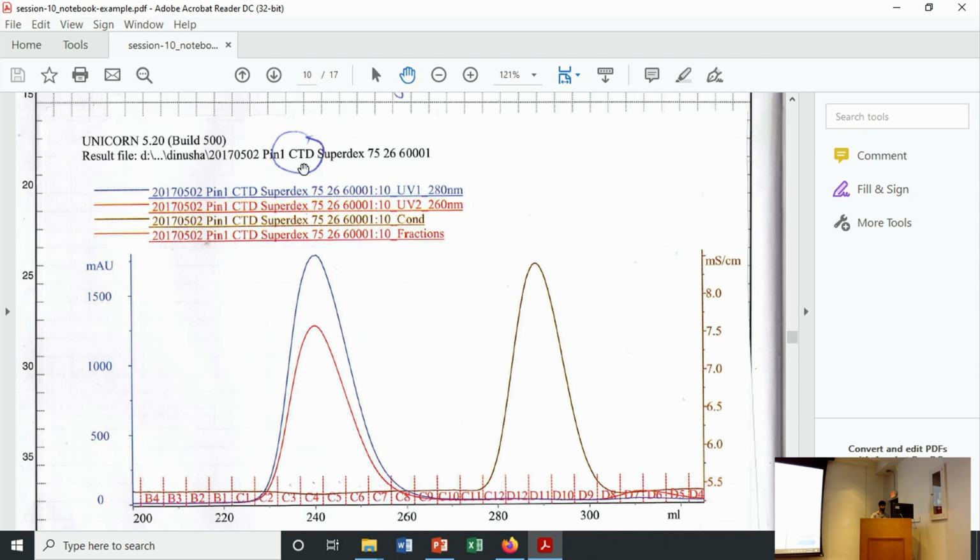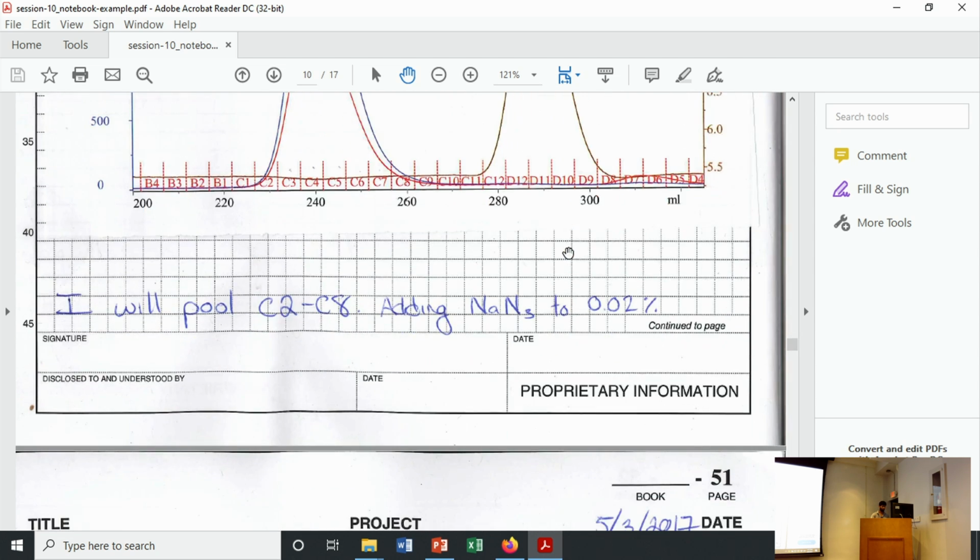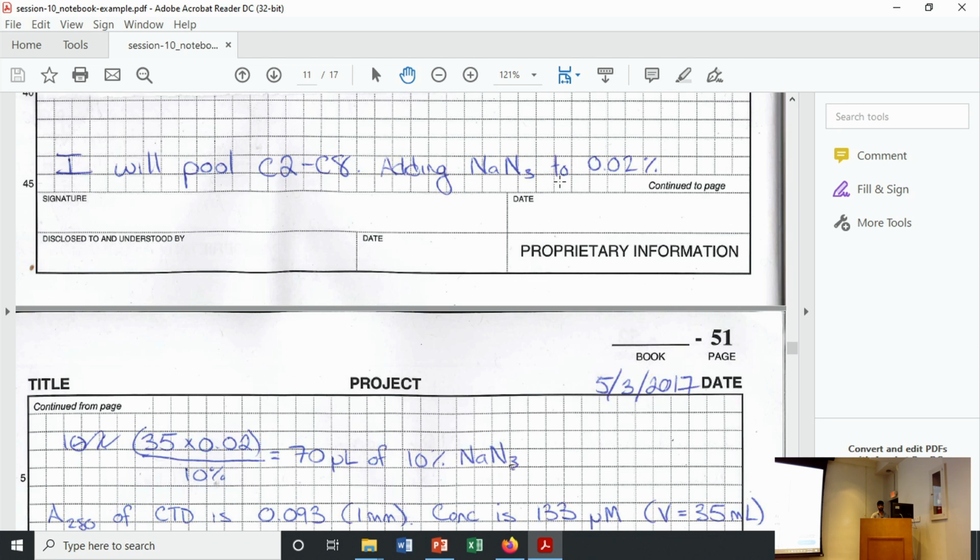Again, in our systems we normally have an account for different people. So you can see he has worked under, there was a student called Dhanush. So in her account, all the things related to the result files are there, and all things are documented in a proper way.